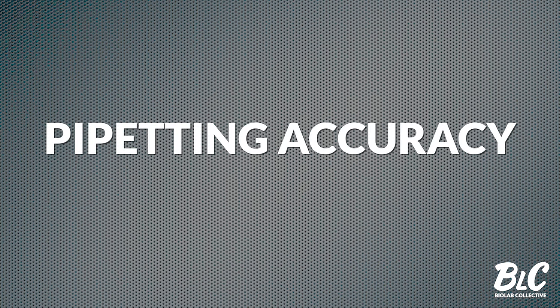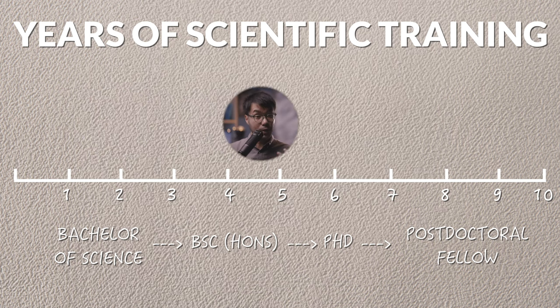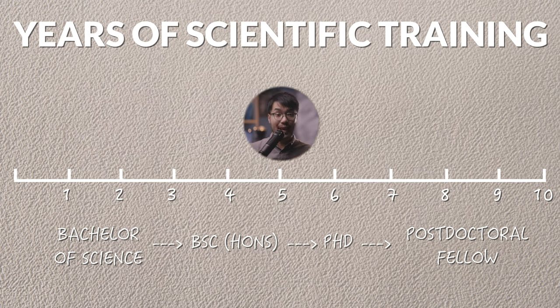Today, we're talking about pipetting — moving small volumes of liquid from one tube to another. It wasn't until the first year of my PhD, four or five years into my training, that I realized my pipetting accuracy was much worse than it should be. Everyone assumed I should already know this, so nobody took the time to retrain me. It was super embarrassing, and I had to figure out where I was going wrong on my own. Hopefully, this video makes the process easier for you to reverse engineer your own technique.